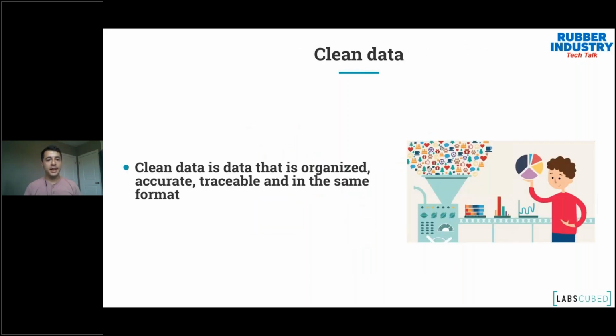So clean data. Clean data is organized, it's traceable, in the same format, hopefully in a cloud-based system, so you can do stuff with it in the future. And I think that's a really important part of it as well. For example, if you're looking at an Excel sheet and numbers are randomly placed all over it, there are no headers and no information connecting anything, you wouldn't be able to make sense of it, and neither would a computer. That's the simplest way to think about clean data. That's why when you automate your production and manufacturing in labs, you're collecting really good, clean data that you can then use in the future to create really smart plants and labs.